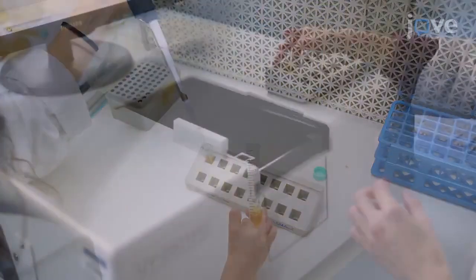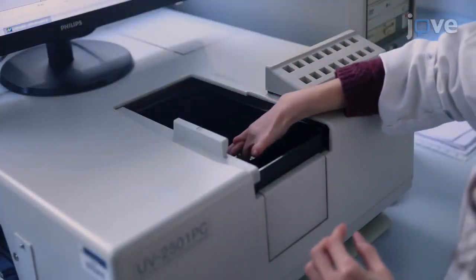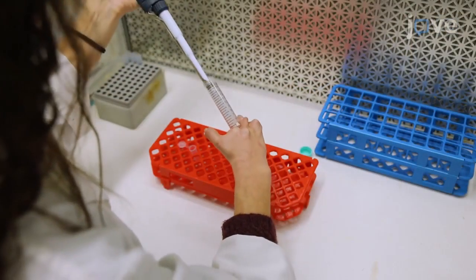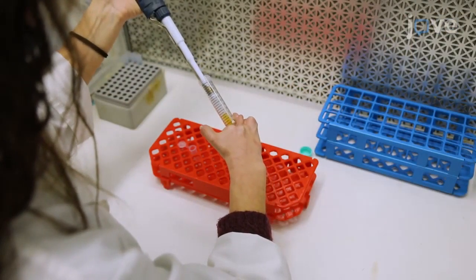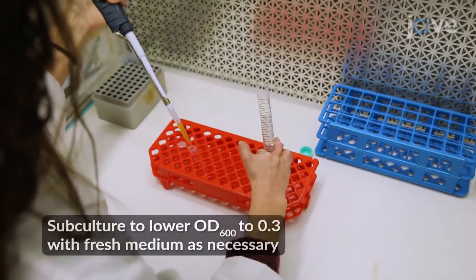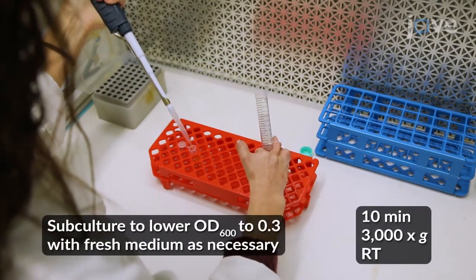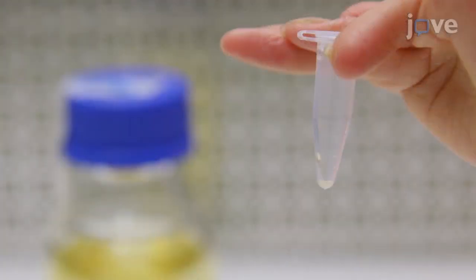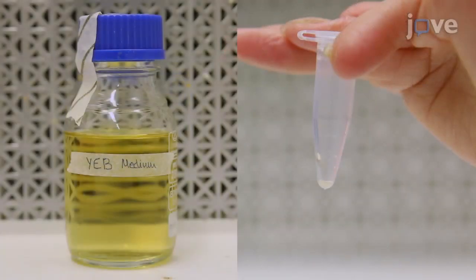For A. tumefaciens transformation, measure the optical density the next morning. When the optical density at 600 nanometers, or OD600, reaches 0.6 to 1, centrifuge 1 milliliter of the Agrobacterium culture and resuspend the pellet in 1 milliliter of fresh YEB medium without antibiotics.